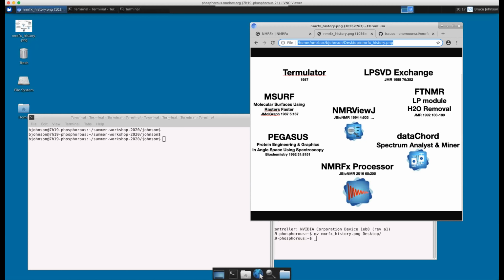like that. I spun off a couple programs from that, Datacord, a small molecule analysis program, and Datacord Spectrum Miner for metabonomics, both of which are actually in the box. And those started incorporating some processing, and it struck me that we might be able to actually fill in the whole, as I say, soup to nuts.